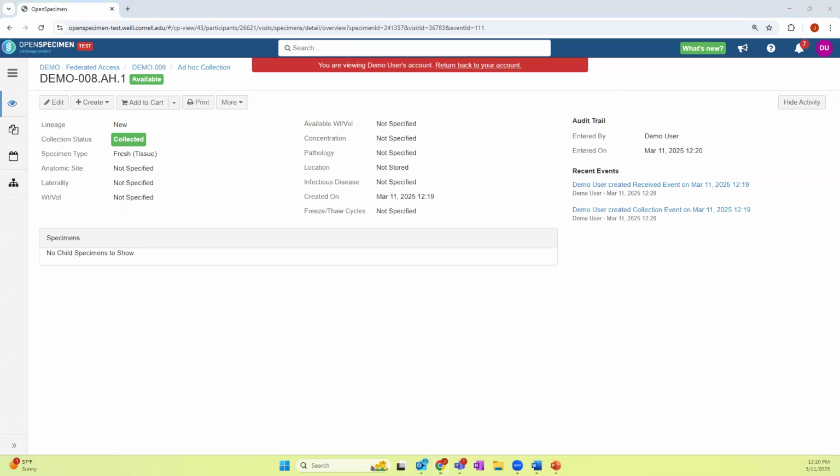Just going through the questions in the chat. Is this a resource to help with sample tracking? Yes, it is. We can help with sample tracking. It depends on what samples you're talking about. But we'd be more than happy to chat with you about that, either later today or later in this chat discussion, or we can share an email that you can reach out to us and we can schedule a quick consult for you.